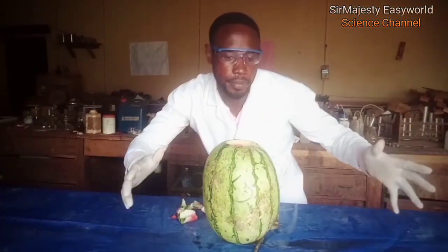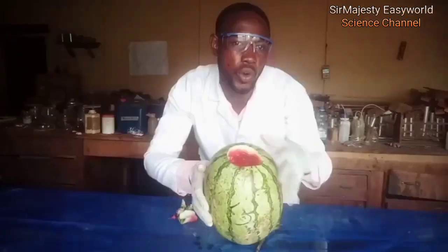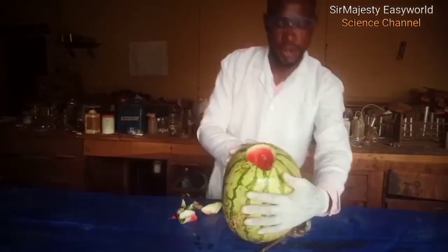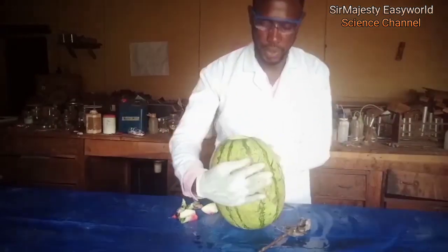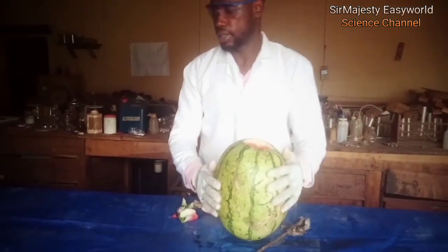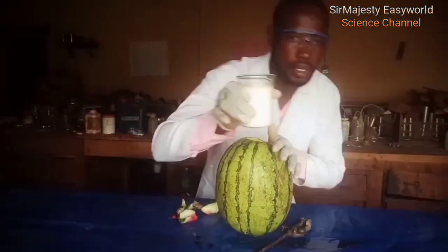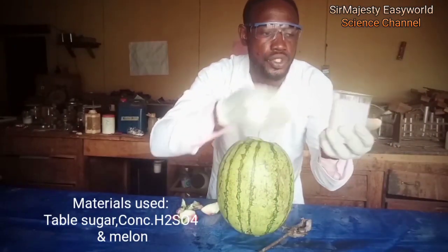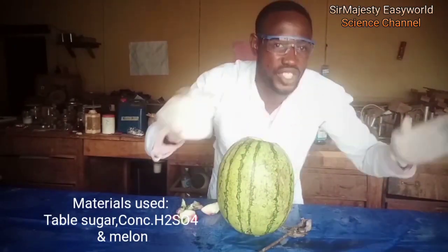Okay, let's carry out some crazy experiment. We want to make a black monster grow out of this and it comes out immediately. That's magic but it's gonna happen now in front of you. So what we're gonna do: we need the stairs, we have made the hole. Next we need table sugar, about 250 ml by volume. That's your sucrose, table sugar you want to use to drink your tea.